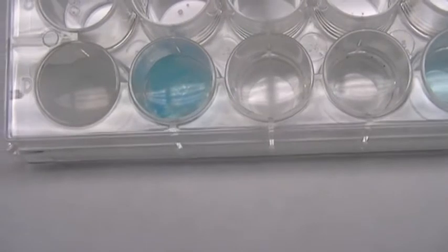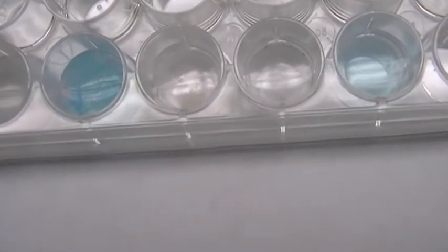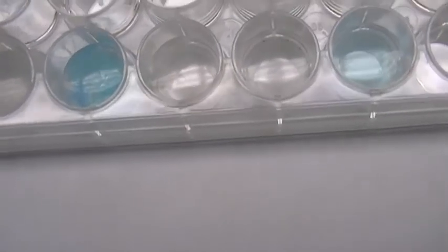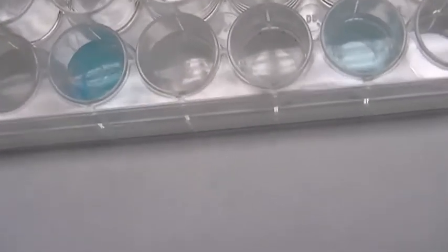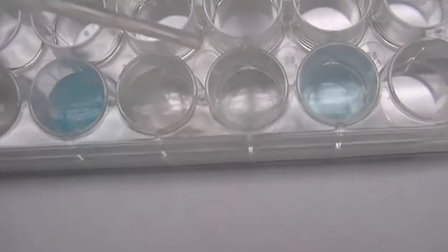This is forming a copper complex ion. All right, and then when you put it into the zinc, you got some white precipitate forming there as well, with the silver and the 1 drop of copper.